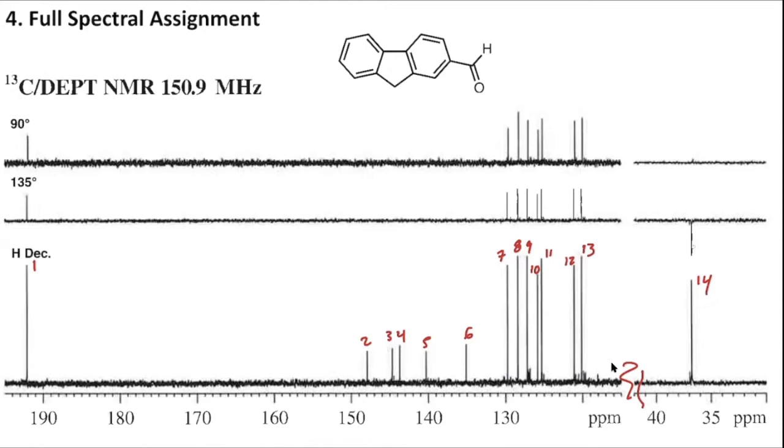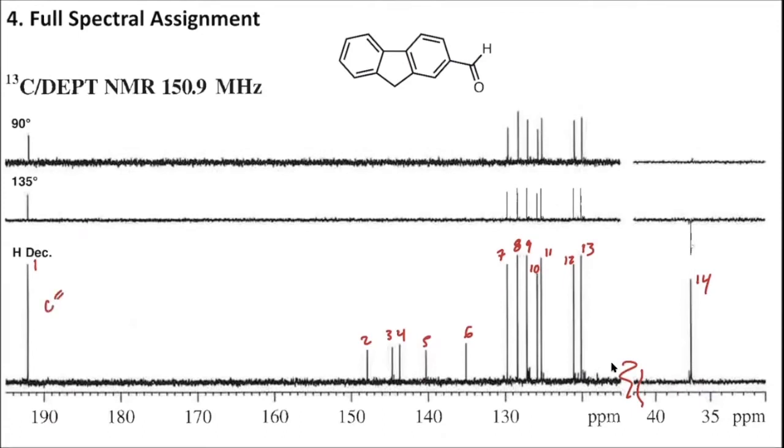So thinking about chemical shifts here, we again seem to have two outliers up here above 190, and then this one that we had to kind of cut off so that you could see it at a very low ppm around 37. What might these be? If you are thinking back to the analysis we did for the protons, you may already have an idea that if we have a carbon that is really, really strongly downfield shifted, that often corresponds to a carbonyl peak. And of course, we do have one carbonyl carbon at our aldehyde. So that is almost certainly our aldehyde or our CHO carbon.